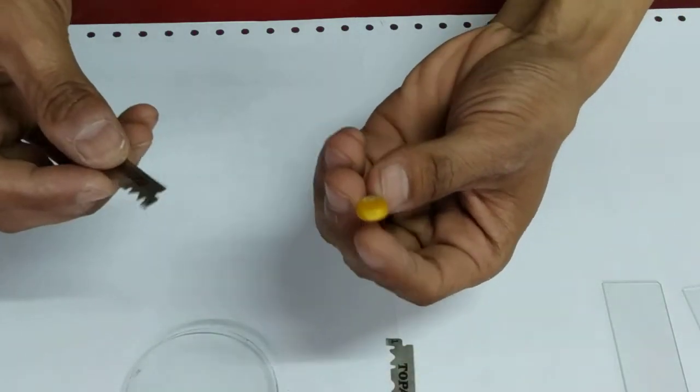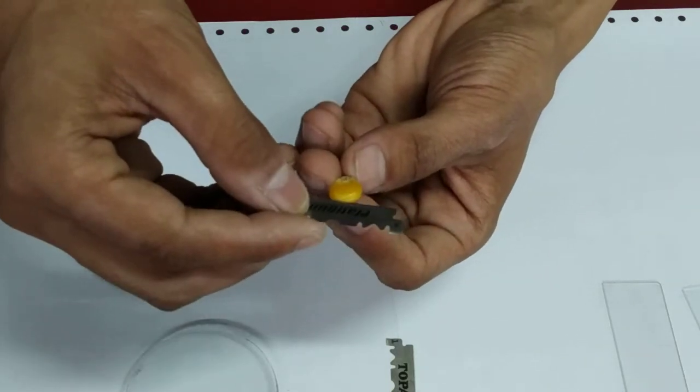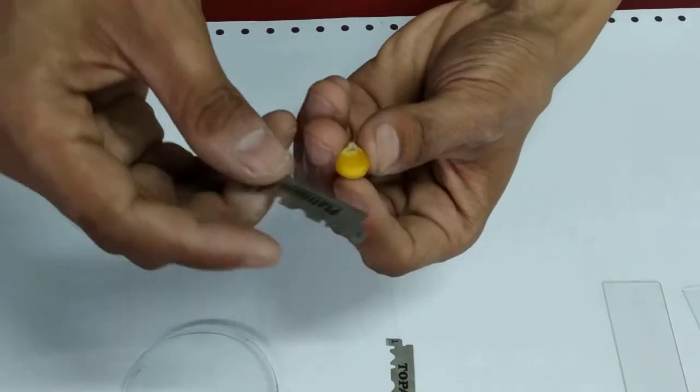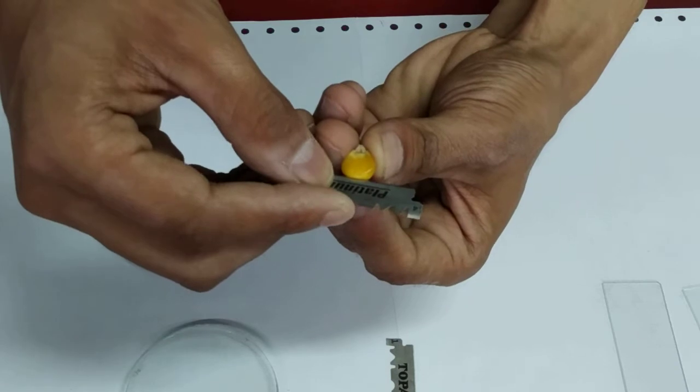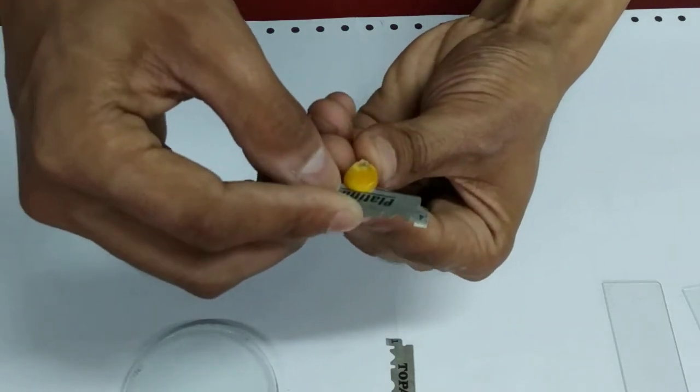By longitudinal section what it means is we are not going to cut it in two equal halves, but rather we are going to cut from the top to the bottom. So just take a look at this. First I am going to cut through the middle portion.